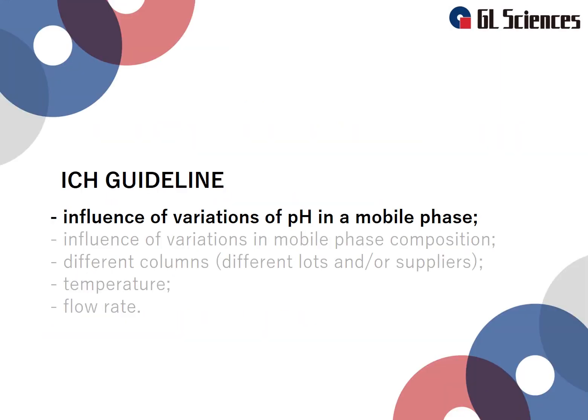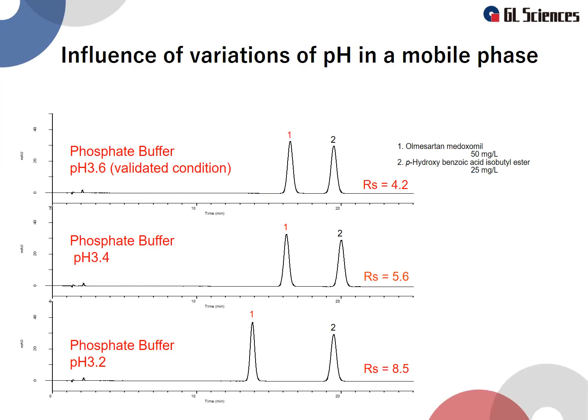In this video, we will explain the influence of variations of pH in a mobile phase. There are many troubles caused by mobile phase pH in inquiries we received. Here you find three chromatograms made with different mobile phases with a pH difference of 0.2. As you can see, this small difference creates large retention time differences, even when using a buffer. In this particular example, the system suitability test might have a negative result, especially when the resolution has to be a value of 5 or higher.